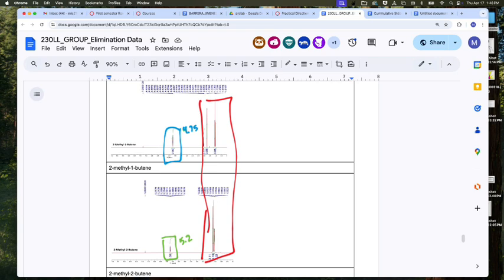Okay? We decided, or rather I decided for you, that we didn't need to evaluate out there because we're not trying to determine the identity of your product based off a clean spectra. We're just saying, do we see these characteristic signals? Does that make sense? Okay. So, if I have a signal at 5.2, I have 2-butene. If I have a signal at 4.7, I have 1-butene.